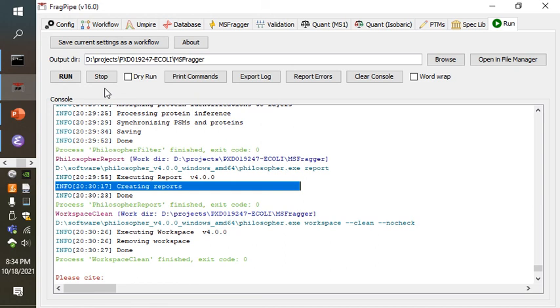But as I was saying, we should be really careful about assuming that only proteins detectable by bottom-up can be seen by top-down. Top-down surely can identify some proteins that would not cut the mustard in a tryptic bottom-up analysis.